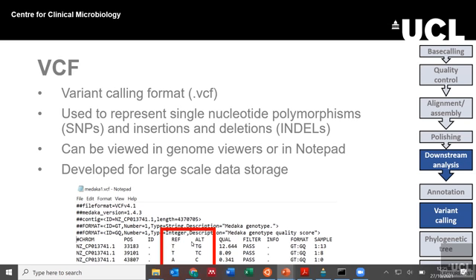As you can see down here in this red box, your reference genome says it's a T, but the alternative, which is your genome, suggests something different. So it basically goes along and picks out all of the SNPs that are different and points out what the difference is. And these can be quite large files. You might find that there's quite a lot of SNPs or individual bases, so they're quite large.